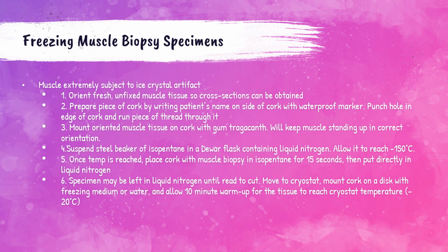As I've stated previously, muscle tissue is extremely prone to ice crystal artifact. Unfortunately, this artifact can make the muscle biopsy stains unreadable. So it's very important to correctly freeze all muscle tissue. So the following is Frida Carson's recommended procedure for freezing muscle biopsy specimens.